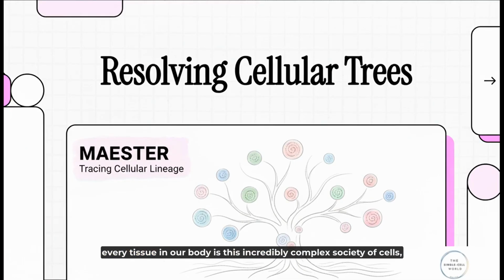You know, every tissue in our body is this incredibly complex society of cells, and they all come from just a single ancestor. But how do we actually map out their family trees? How do we figure out who's related to whom to understand how we develop, or how diseases like cancer take hold? Well, today we're going to dive into a new method called MAESTER, which is giving scientists a way to trace these cellular family trees with a level of detail and at a scale that just wasn't possible before.